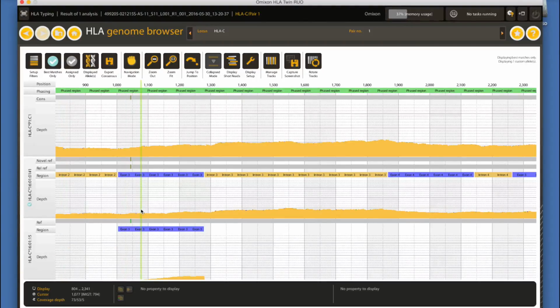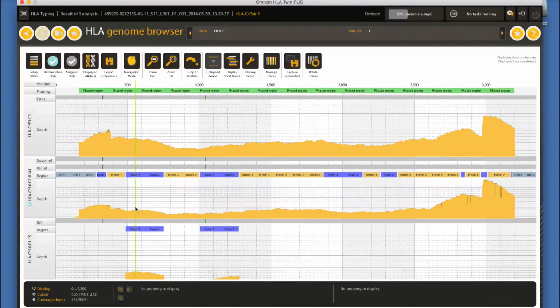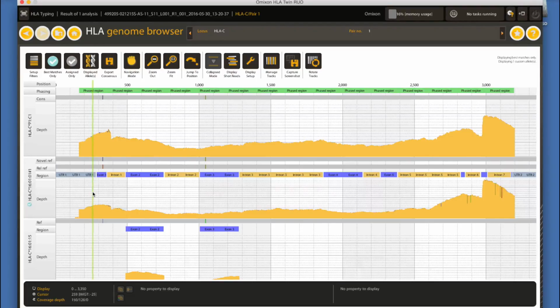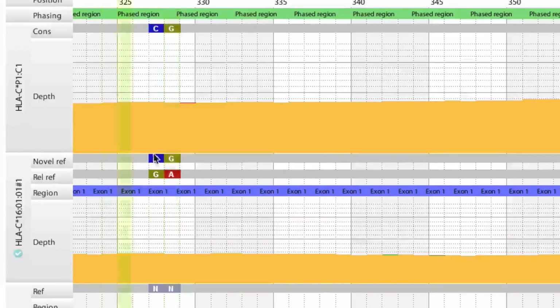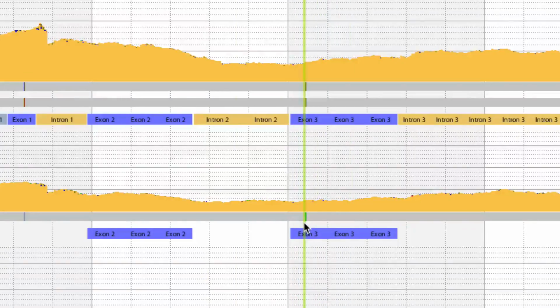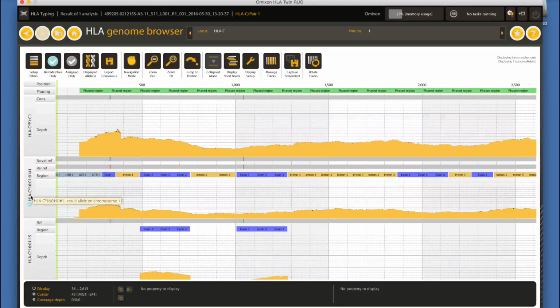It is important to remember that the name of a novel allele is not verified and just an indication of similarity based on the sequence matching in the sample. In this example, if we have two class 1 alleles in the database where one has two mismatches on exon 1 and the other has only one mismatch on exon 3, then the former will be selected. This is important from the aspect of the expressed protein, and it also helps with the verification of the novelty.